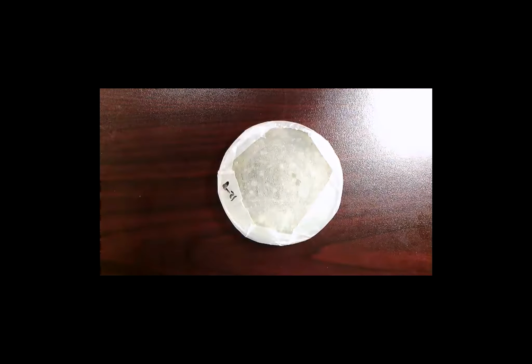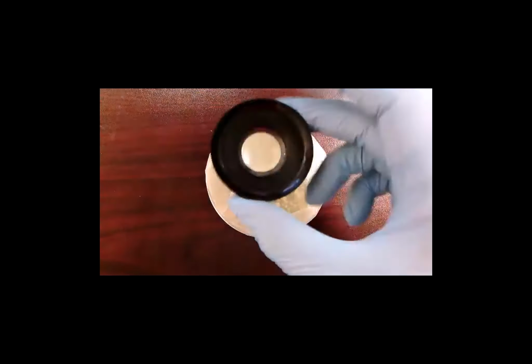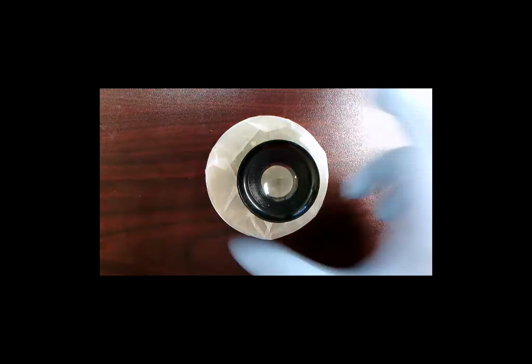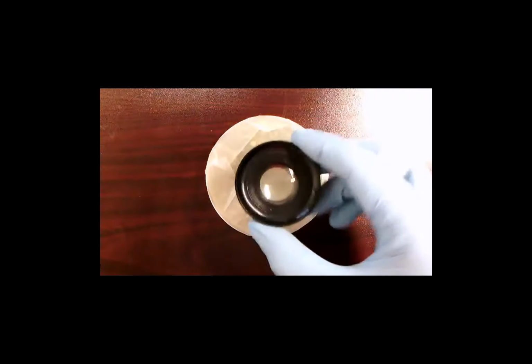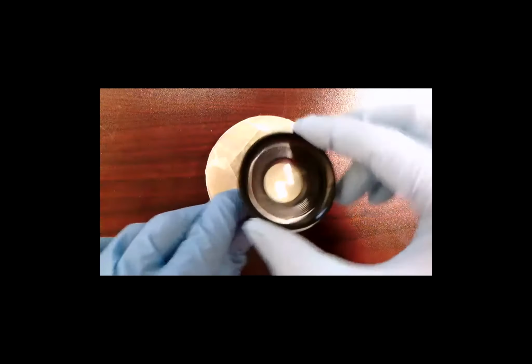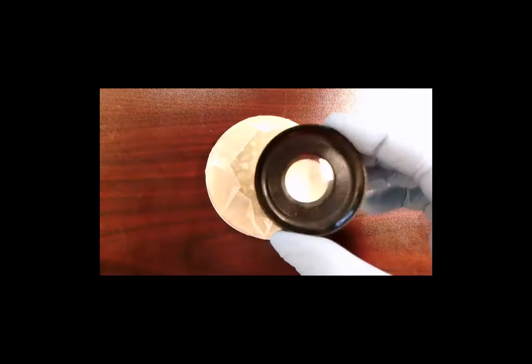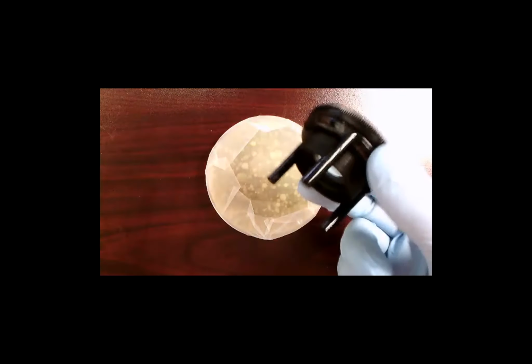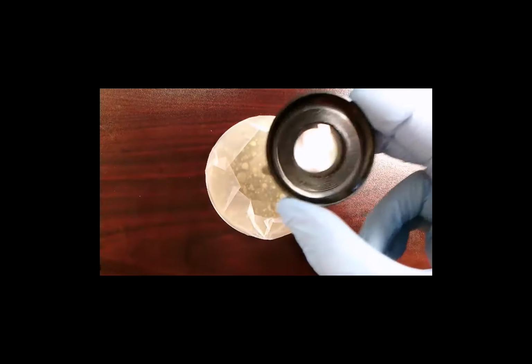Okay. So also, one thing we will provide the students the day of the event is a magnifier that the students can use to help count and help see the small bacteria. And it's pretty easy. The ones we have have little stands on them. They can set them right on the dish, and they turn left and right to focus in better on the bacteria. So if you want to train your students on how to use these little magnifying glasses, we ordered these from Carolina Biological as well.